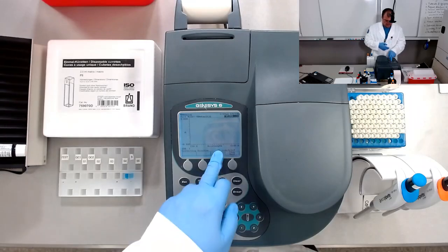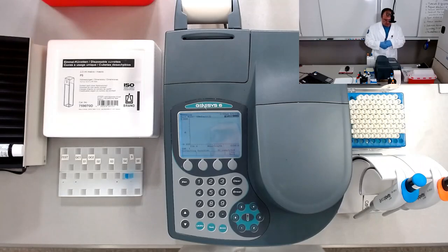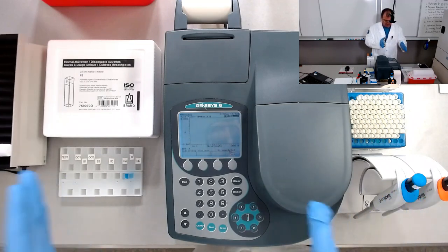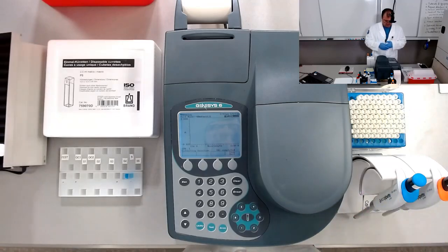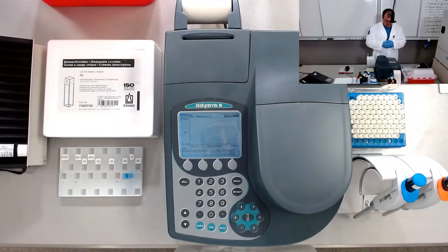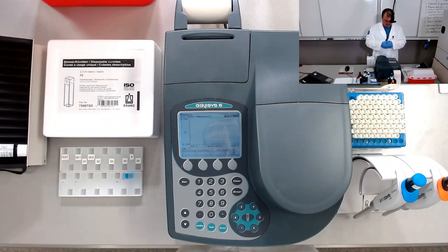It shows us the percentage of completed work, 2, 4 percent, and it goes this way until it collects the whole baseline between 190 and 1100 nanometers with a 5 nanometer step. So absorbance is measured at every 5 nanometers.